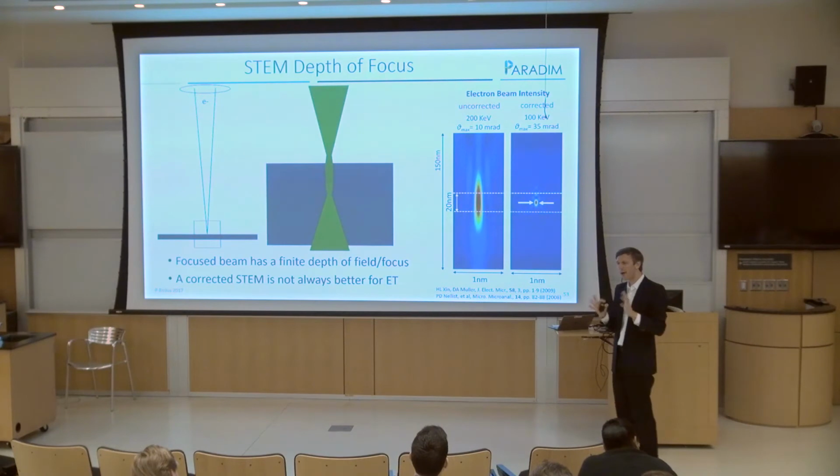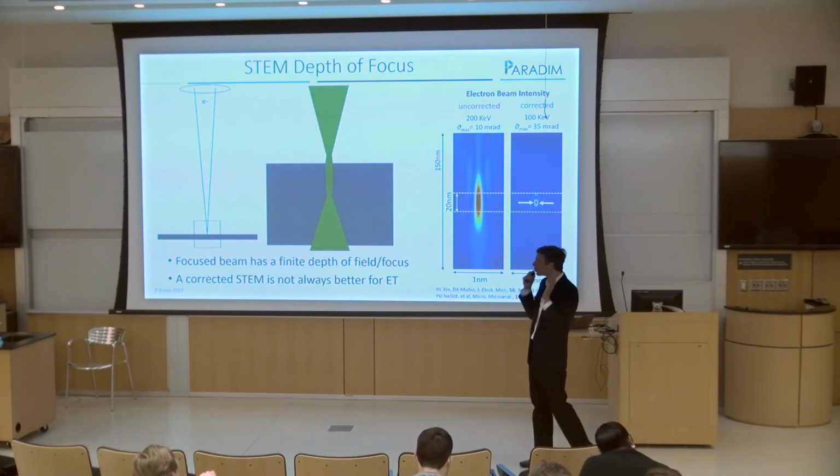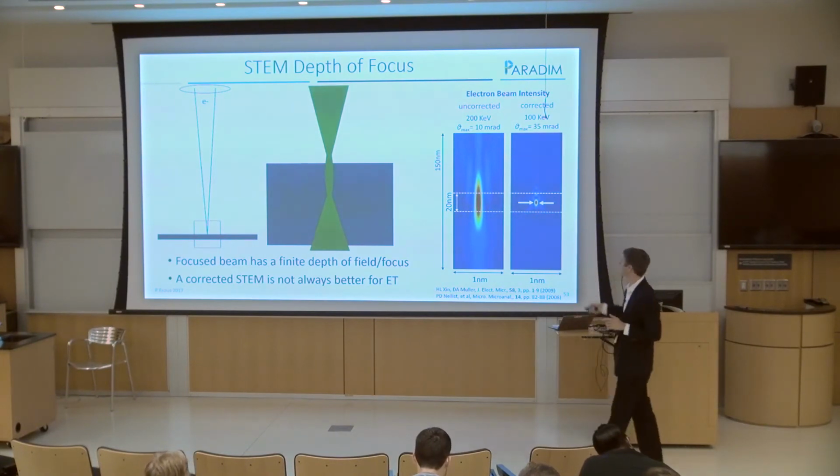A lot of people say, I want to use your corrected microscope to do tomography. I'm like, no, you don't. Okay? A normal electron microscope is probably good enough for most people. But you really have to think about this depth of focus issue.